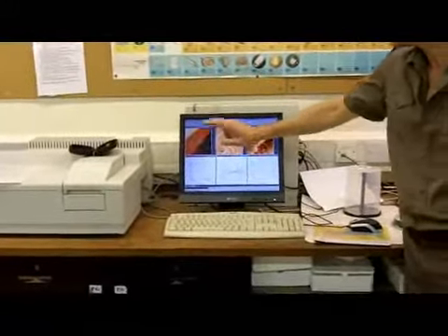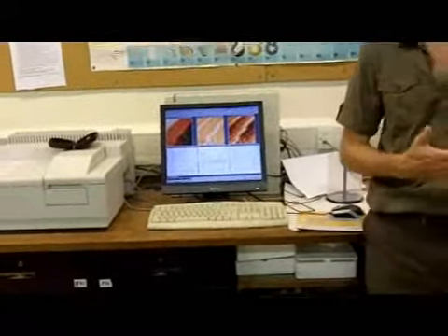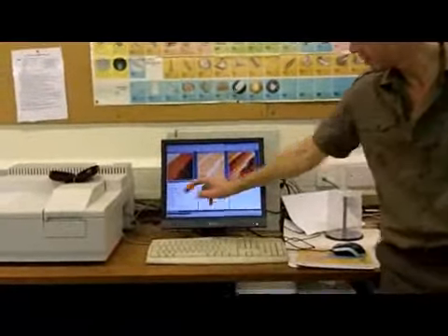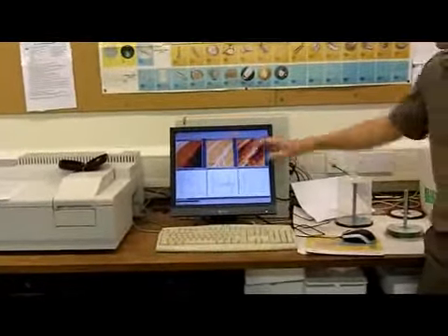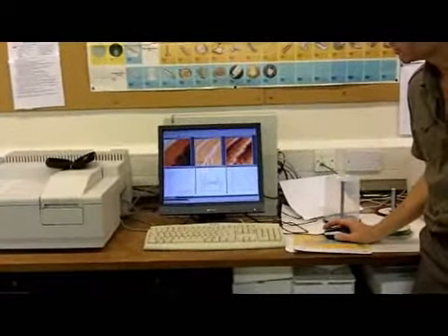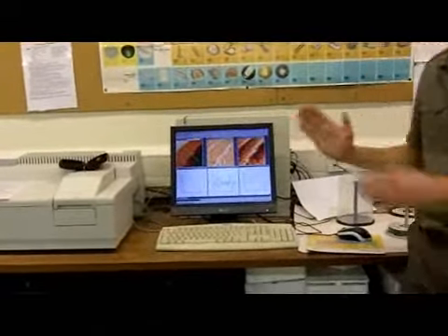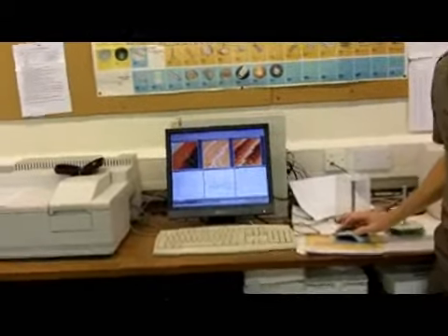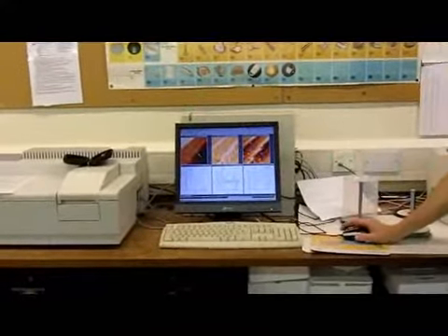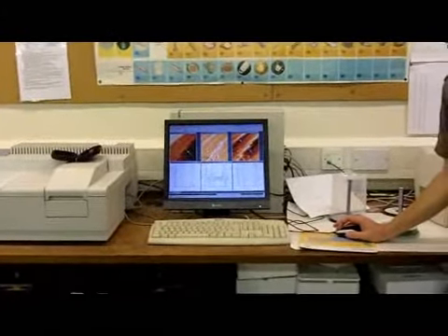Okay, so we've got a profile. What we're going to do is use that profile on that image. The next thing we need to do is measure things on that profile. So if I click on the profile itself, you'll see the toolbar at the top changes, and there are a number of things that are useful, but the one that you really want is measure the distances. And it's this button which seems to have two vertical bars. So if I click on that, you see crosses appear here, and these measuring sticks appear here, and we can grab hold of them and move them.